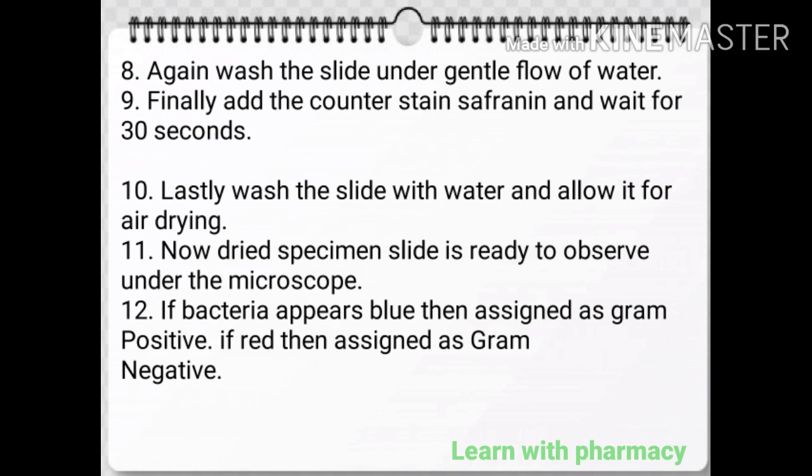Lastly, wash the slide with water and allow it for air drying. Then the dried specimen slide is ready to observe under the microscope. Finally, if bacteria appears blue then assigned as gram-positive, and if red then assigned as gram-negative.